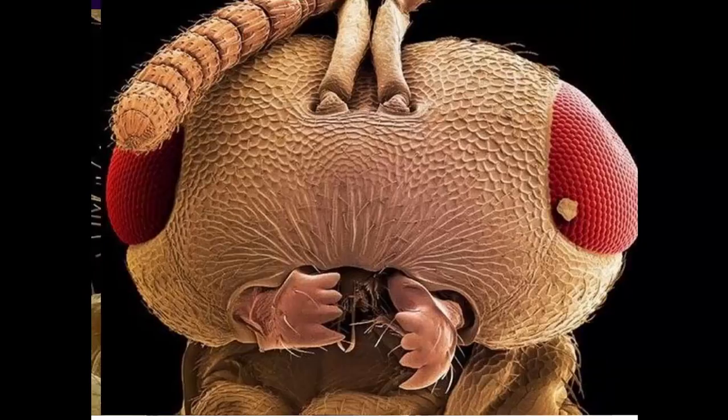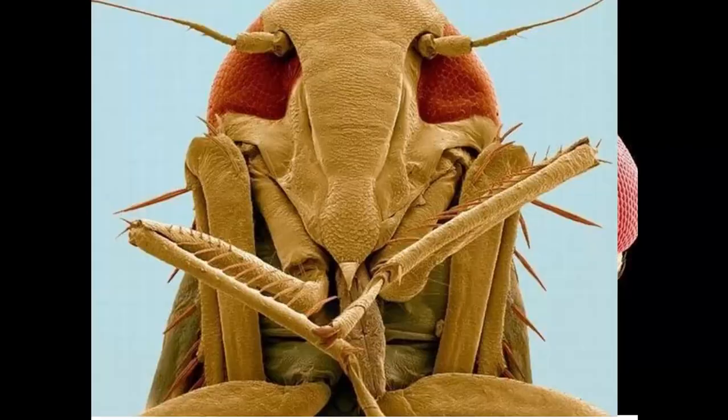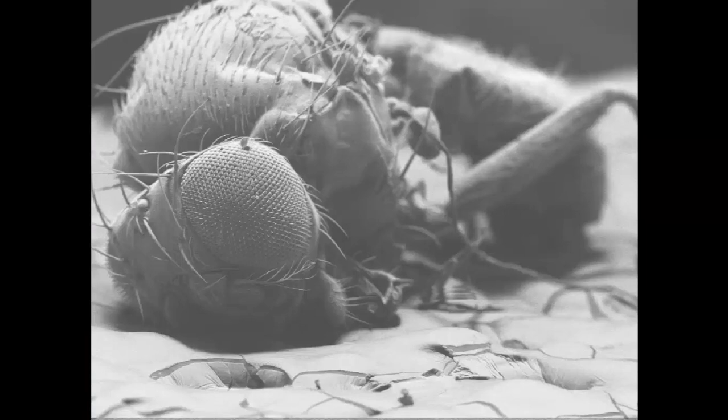I said they give you an image a million times greater. They don't have to. When you're taking the picture with the electron microscope, you can magnify only 10 or 100 times if you want to, but it could go up to 100,000.